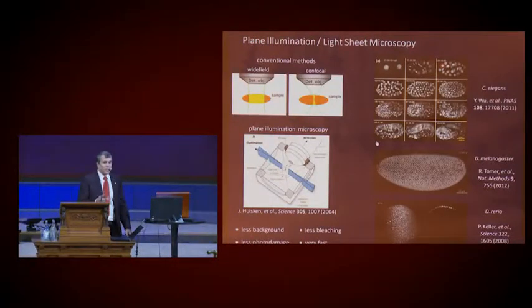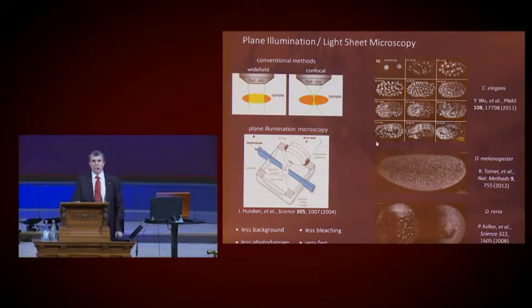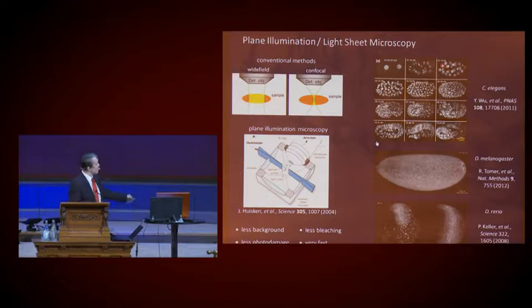So the good news is the standard live imaging tools leave a lot of room for improvement. They're basically the wide field and confocal microscope. The problem with using these in a 3-dimensional context is they're used in this epi configuration, where you illuminate the whole sample and the light comes back. But there's only one plane that's in focus at a time. So all you're doing is creating out of focus background and doing premature bleaching and toxicity of the rest of that sample.